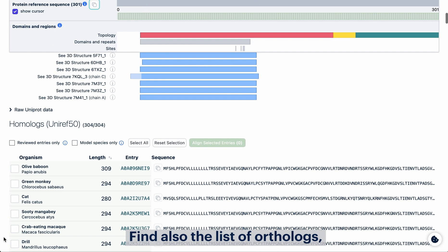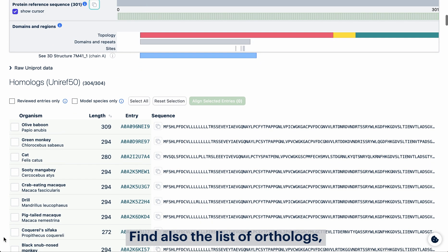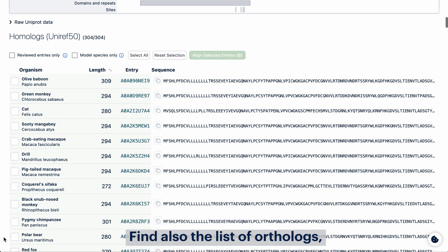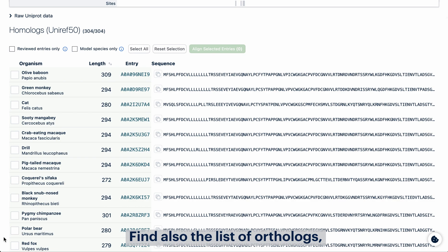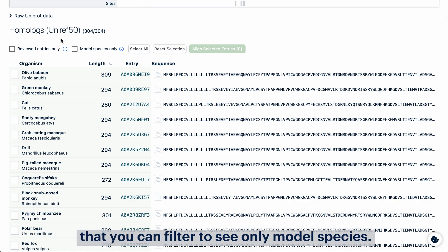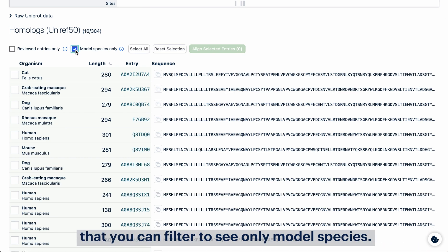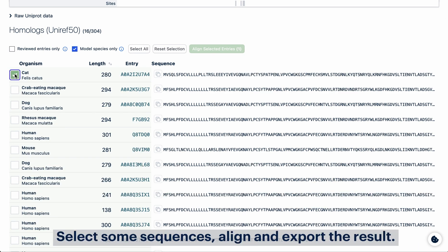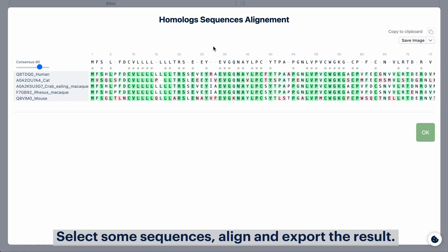Find also the list of orthologues that you can filter to see only model species, select some sequences, align, and export the result.